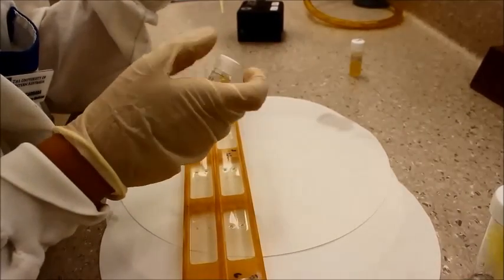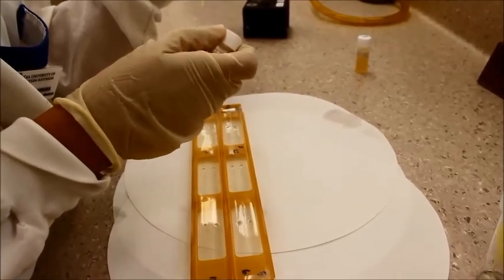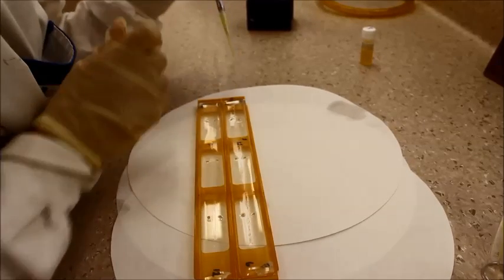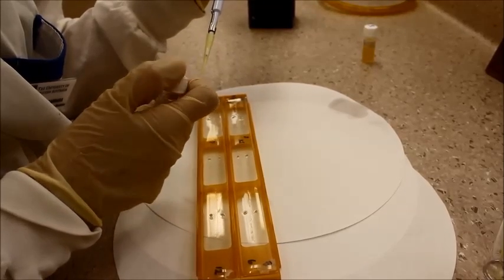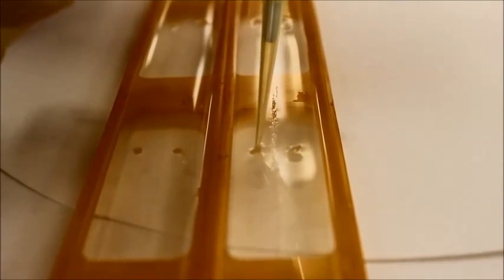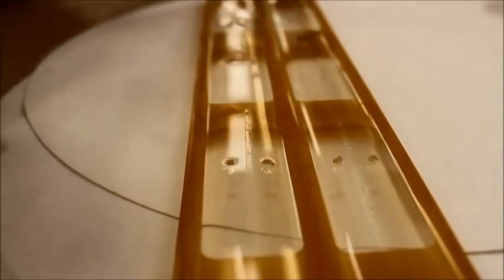Carefully fill the wells of all three slides with five microliters of human serum.